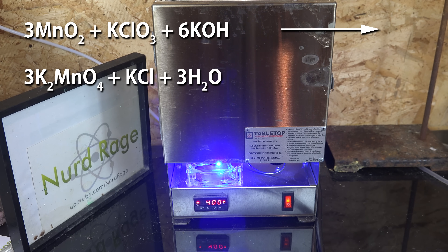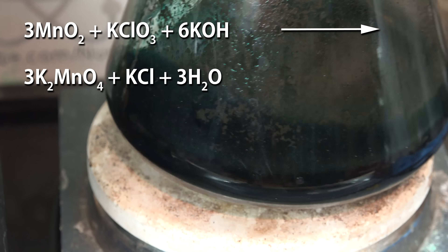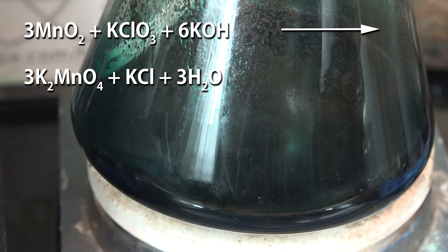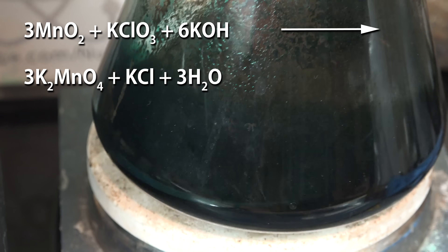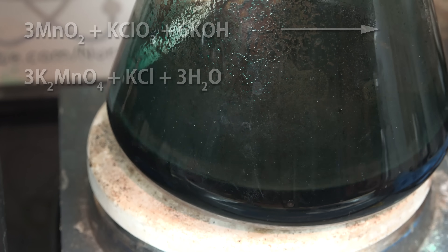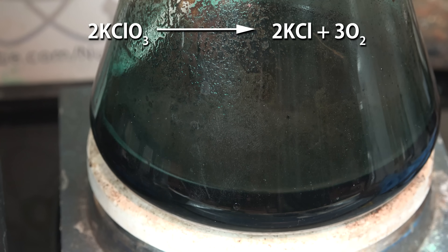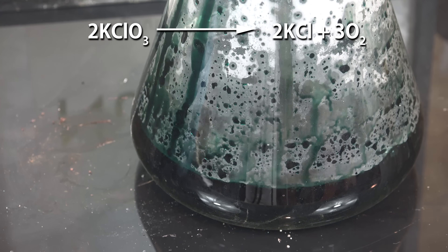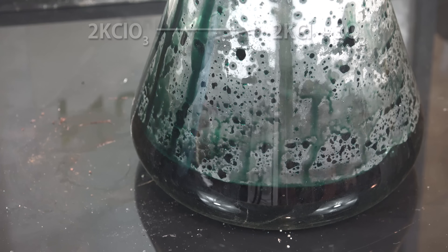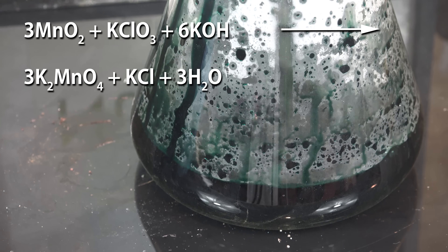What's happening is the potassium chlorate is oxidizing the manganese dioxide to potassium manganate. The potassium hydroxide provides the potassium ions and alkaline conditions necessary to stabilize the higher oxidation state of manganese. Without the potassium hydroxide, the manganese dioxide would just catalytically decompose the potassium chlorate to release oxygen — which actually serves as the basis for creating oxygen in some experiments — but for us we need the potassium hydroxide to make potassium manganate.